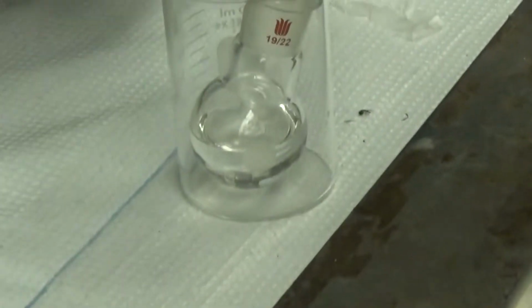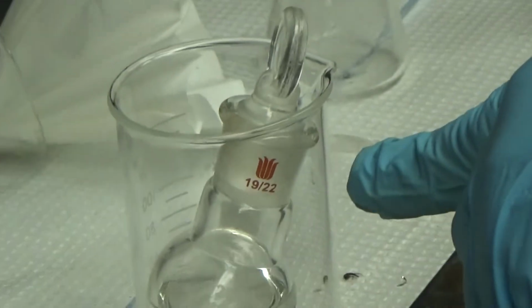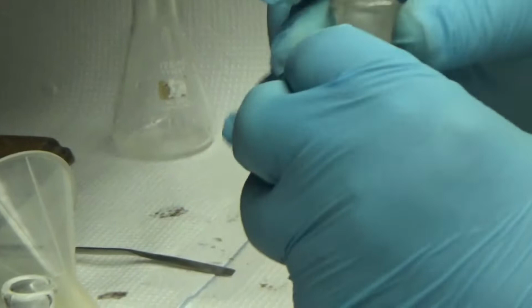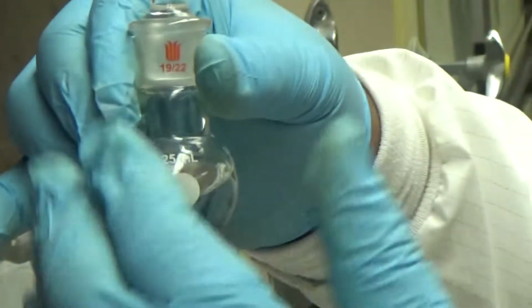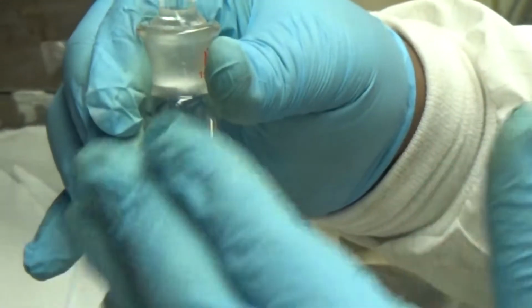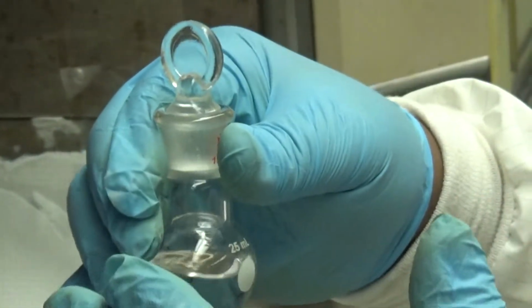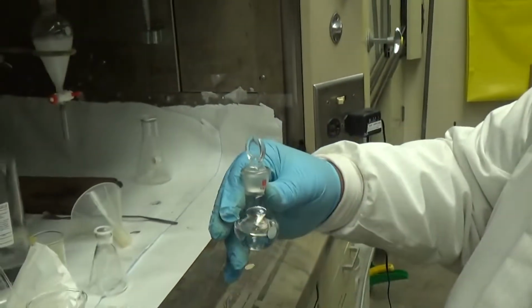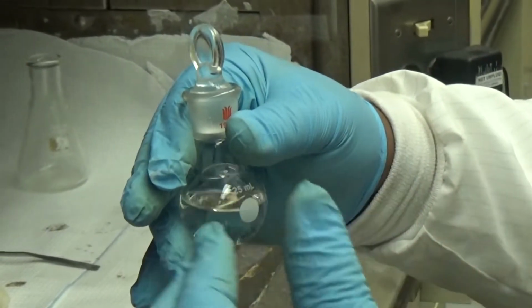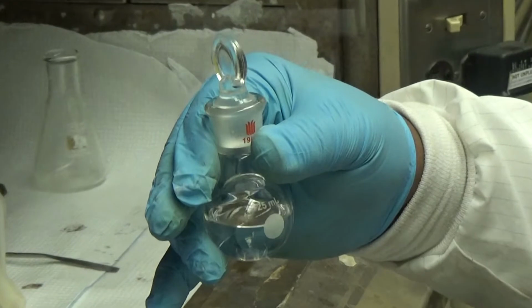Cool. So now I just close that. I should not be inhaling the methylene chloride. Now you have here your dry organic layer, in our case the methylene chloride layer containing eugenol. The next step will be the rotary evaporation. The rotary evaporation is a way to remove the dichloromethane, or methylene chloride, to evaporate the solvent and then leave your good stuff behind, your product.